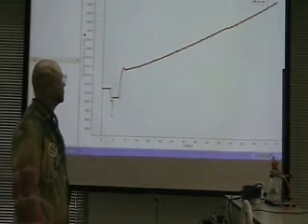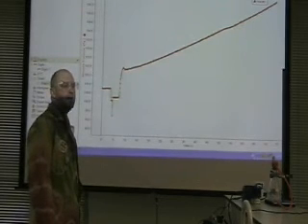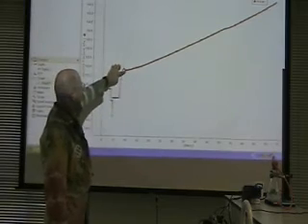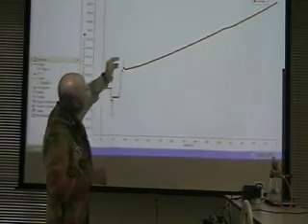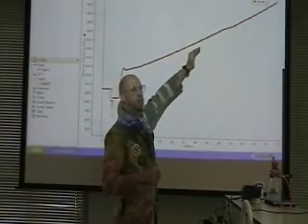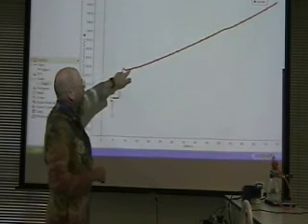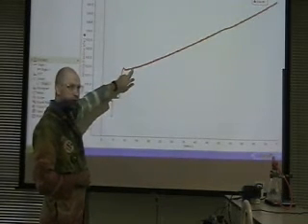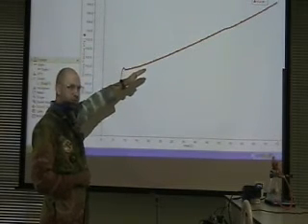Why did it go down? Because I took the plug out. Okay? So basically I'm going along, took the plug out, stuck the plug back in, pressed it in, pressurizes things inside there, and it takes off from that point. Okay? And you can see that this graph gives you a pretty obvious slope. Right? The slope tells you the rate of reaction.